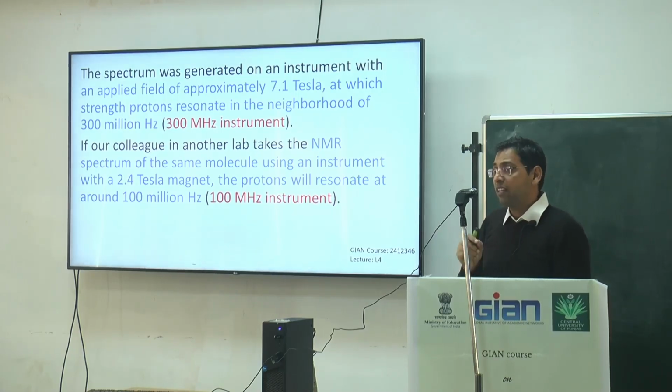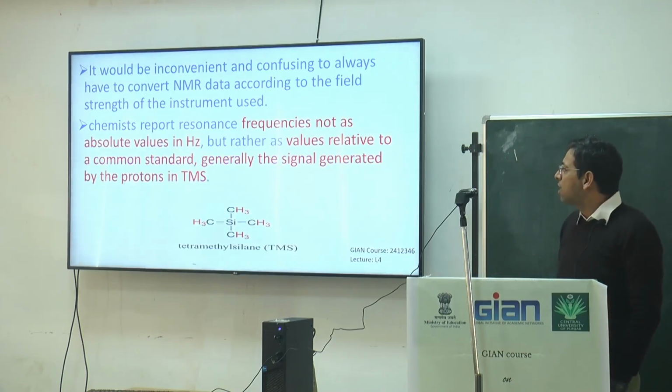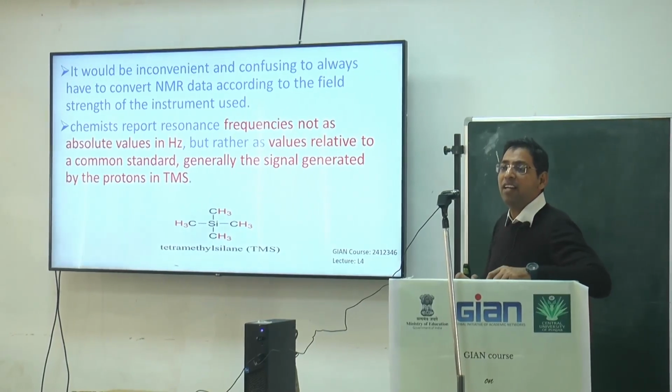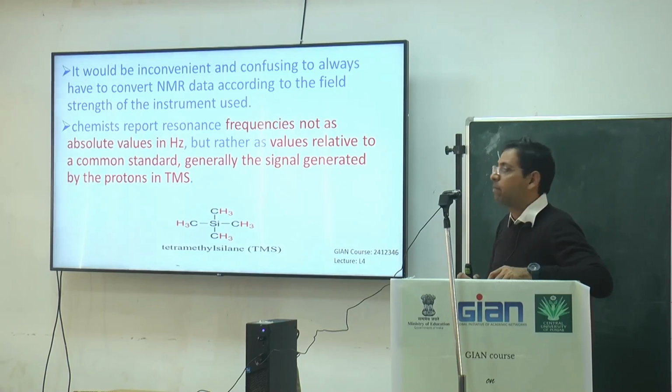Now it seems to be very difficult for all of us. How could we go ahead? We want to avoid this inconvenient and confusing situation of converting NMR data from one machine that has 100 megahertz to a second machine that has 300 megahertz.